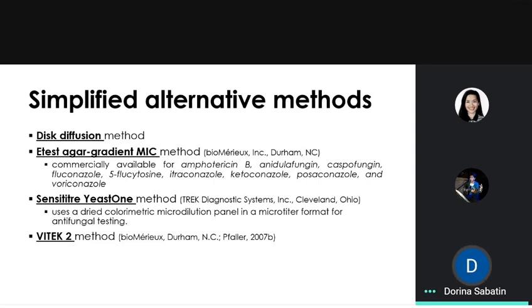So, it's just like that. The antimicrobial disc that we place on our plate diffuses into the media. In its diffusion, the farther it travels from the disc, the lower the concentration.